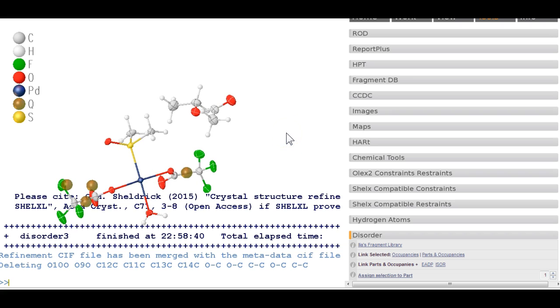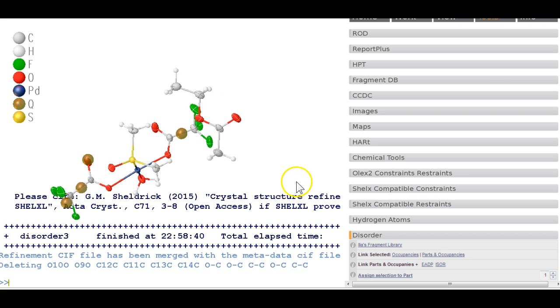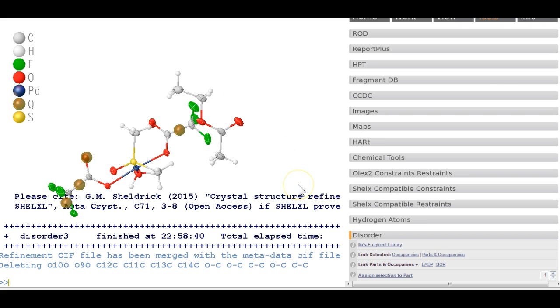So this is how you model entities across symmetry elements. There was another video about toluene across a symmetry element, and this one was ethyl acetate across it. I hope this will help you get along — thanks for using OLEX2.